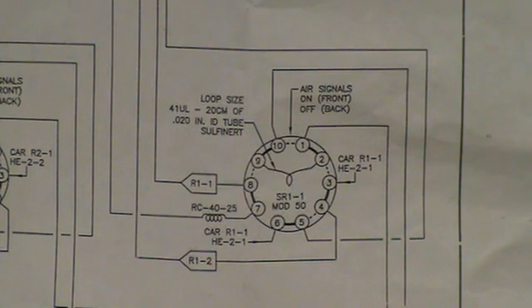When time 0 comes about, carrier that's coming in on 3 was going to 4. Now we're going to turn the valve on. Carrier going from 3 now goes to 2. Sweeps the sample loop like a spit wad. Shoots everything over to 9. Then we are going to go to 8.